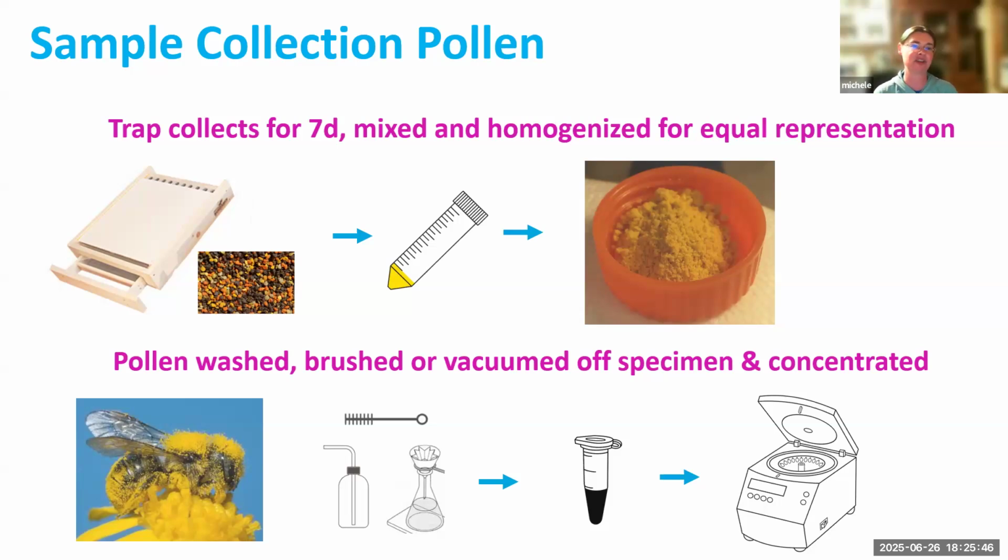So for pollen collection, usually the standard we recommend is you put a pollen trap on for 7 days. You collect it each day. You put it in a bag, you hand mix it as best as you can. You send it to me, and then I do something called homogenization, which is basically taking all of it, mixing it together really, really well, and making sure that all the pollen, no matter where you take that sample from, would be equally dispersed throughout the whole sample. And obviously you can understand why this would be important.